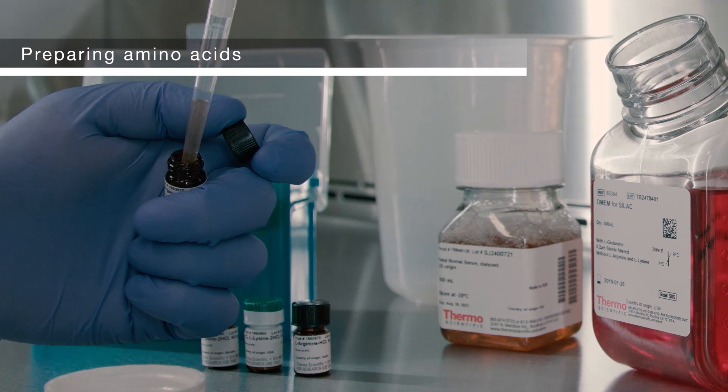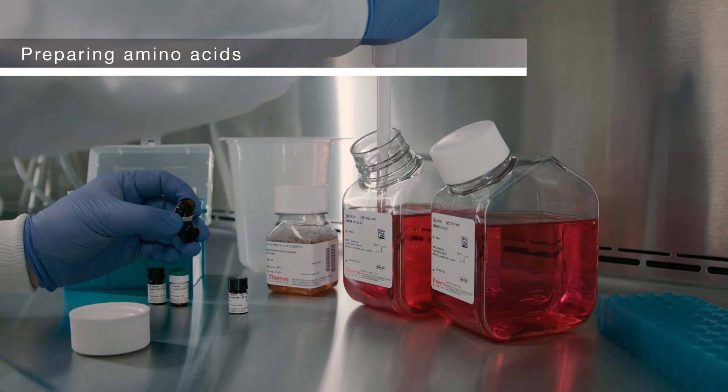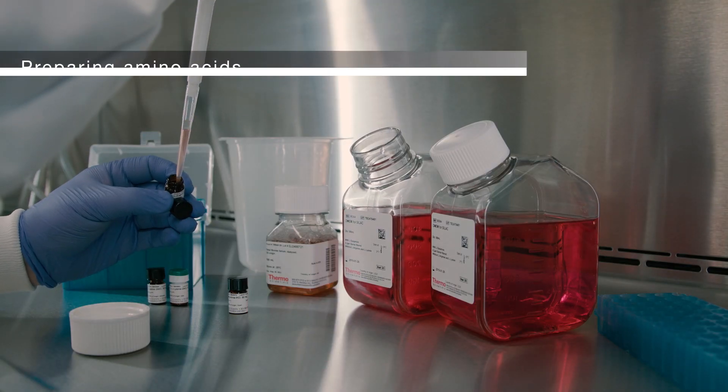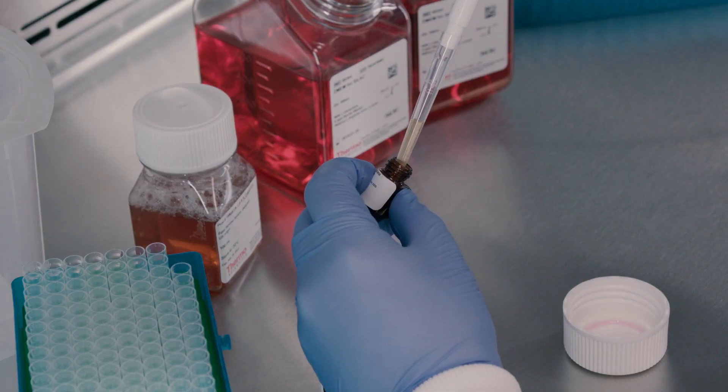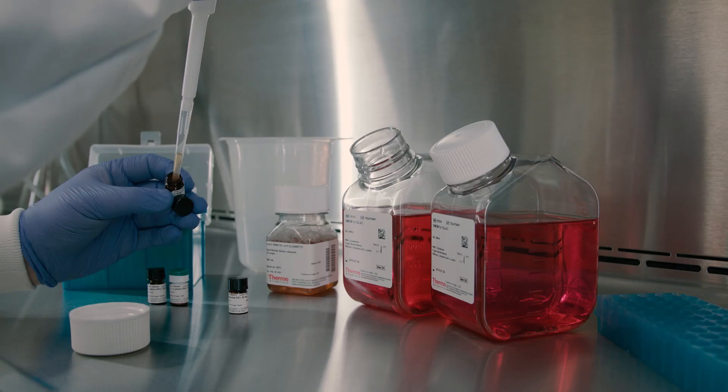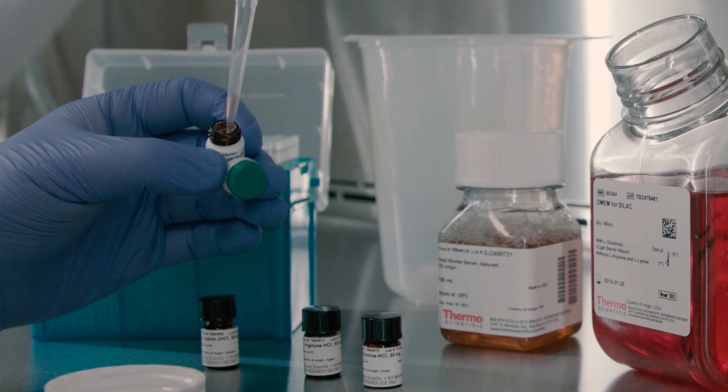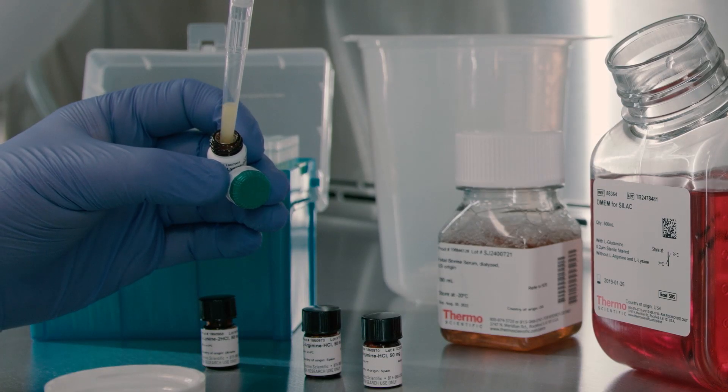The first step is to prepare the amino acids by dissolving 50 milligrams of each heavy or light amino acid in one milliliter of medium and mixing thoroughly. The color of the medium will change from red to yellow upon addition of the amino acid hydrochloride salts.